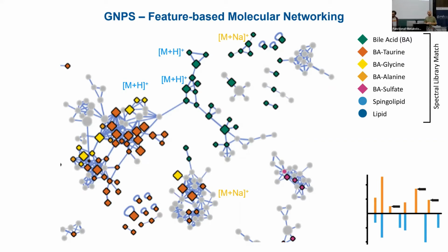So you have sodium clusters for some molecules located elsewhere in the network, because due to different energy levels of these different adducts, they fragment perhaps differently than protonated adducts, and hence they're disconnected. And that I think was or is one of the bottlenecks of just MS2 based networking, and we hope that IIN improves that a little bit.